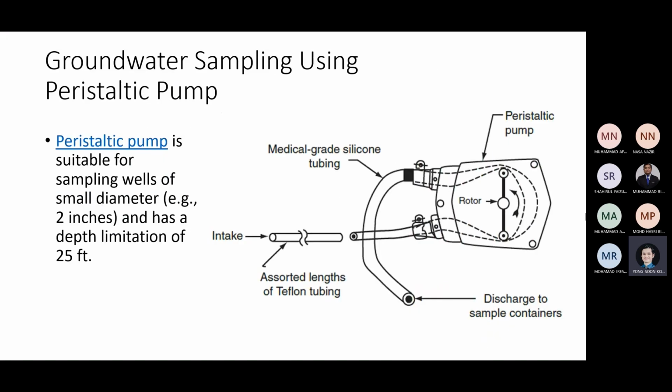But if you have money, like for example, the operators of a landfill, and you want to sample landfill leachate, they will always use a pump. A pump is much simpler, because sometimes the tube wells are very deep. You want to put it down there, how many times can you afford to pull it down and then pull it out? It is very, very tiring. So that's why a pump is more preferred, more practical actually.